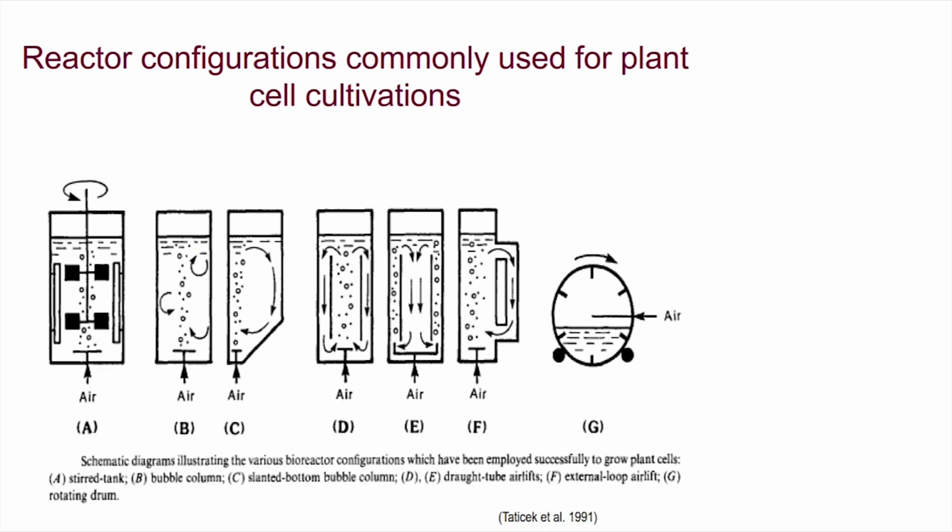Now knowing that these are pneumatically driven reactors, what is the limitation of such kind of reactors? Mixing is a limitation. So any changes, like making an external loop or making the design tapered, are improving the mixing time or trying to overcome the limitation of the pneumatically driven reactors.